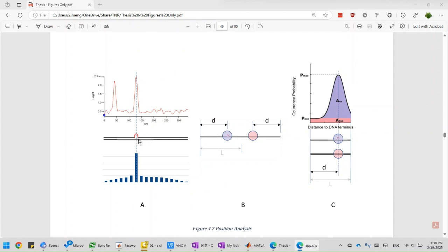So you have one strand that has a DNA mismatch or a bubble or slip out, a kind of structure there, and the protein could preferentially bind that structure, so it prefers that, right? So when it binds to that structure, it forms a peak here. And if you count each one of these locations, then you can combine all of these position readings and form a histogram, right?